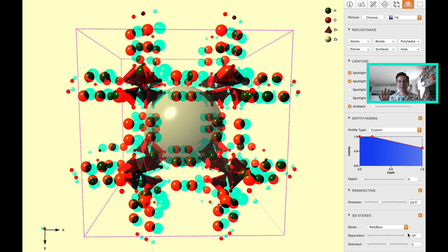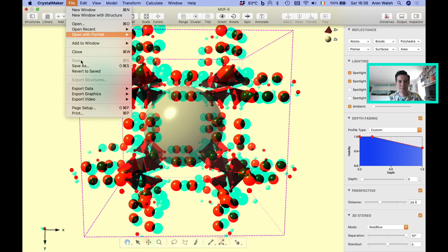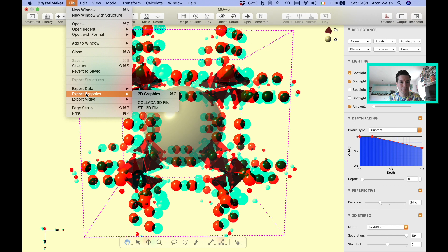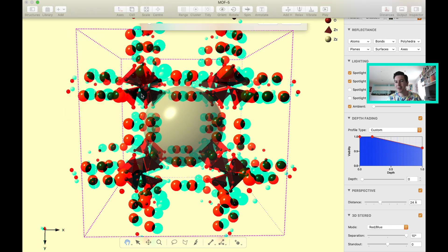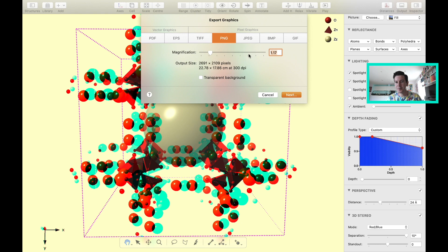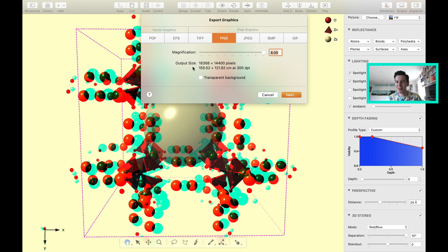When you've finally constructed the image that you want, you simply go to File and Export Graphics — 2D Graphics — and then you can choose different image types. PNG is a very common file format. The magnification tab chooses how large the image is. If you want something to look good in a document, you'll usually need about 1,000 to 2,000 pixels. At the high end you have 20,000 pixels — high enough resolution that you could have a poster on the side of a bus. So this produces something really high quality.